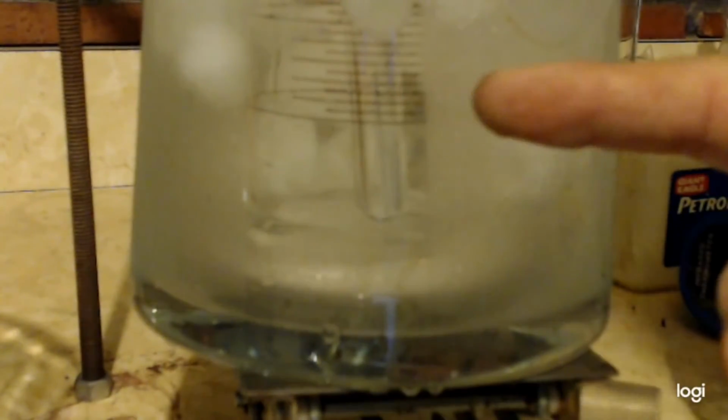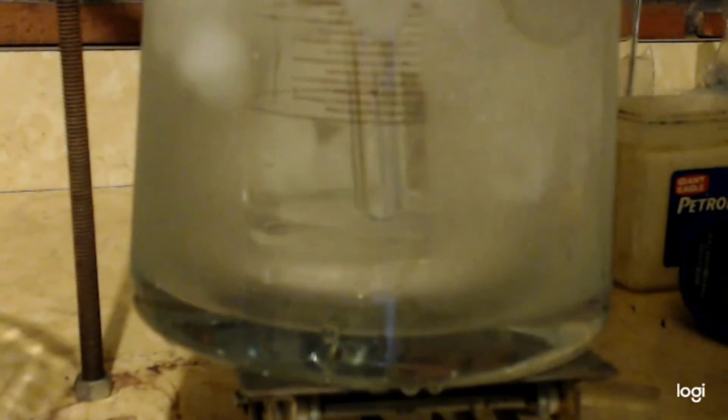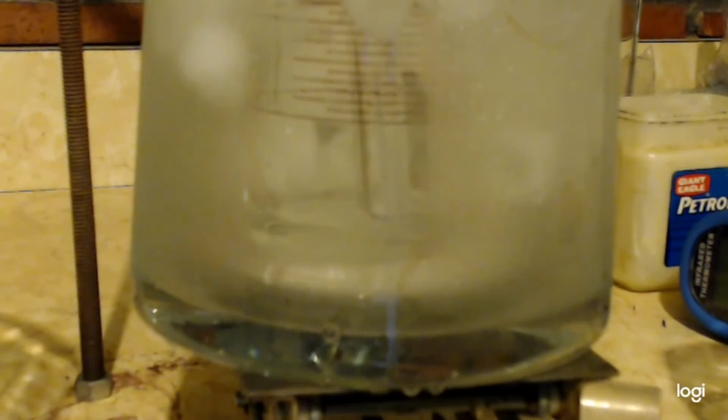Although this has been bubbling about one every 4 seconds. And now it's bubbling, let's see. 1 Mississippi, 2 Mississippi. Now it's coming every 2 seconds. So once it starts boiling and refluxing more, it's going to pick up.